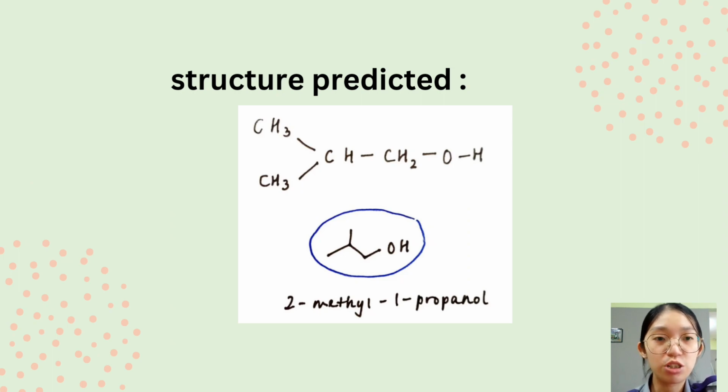And this is how the final structure is predicted, which is 2-methyl-1-propanol.